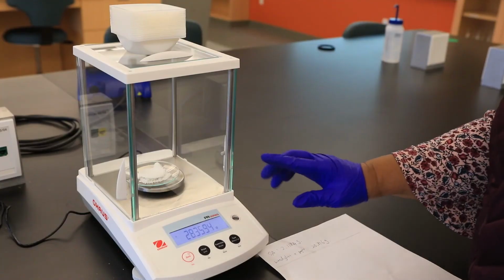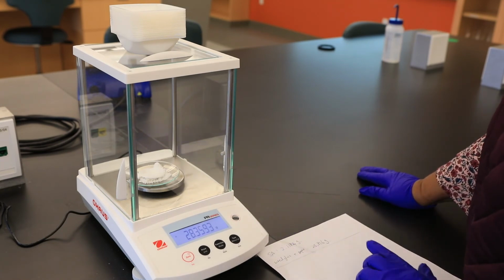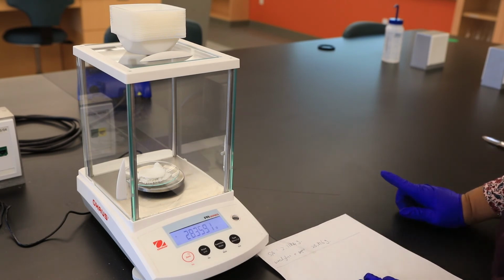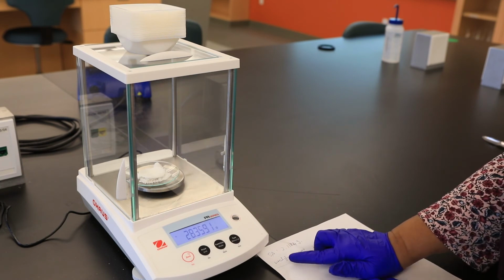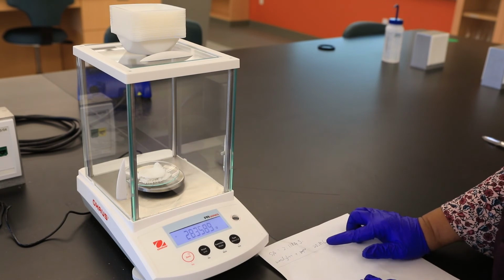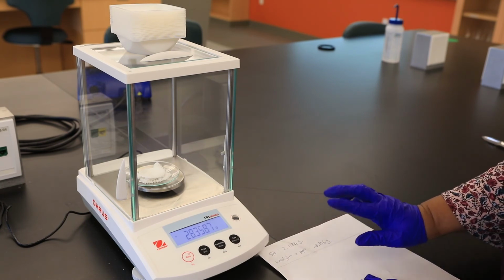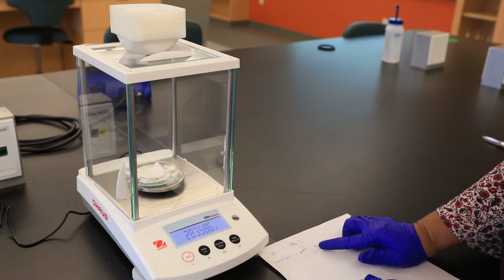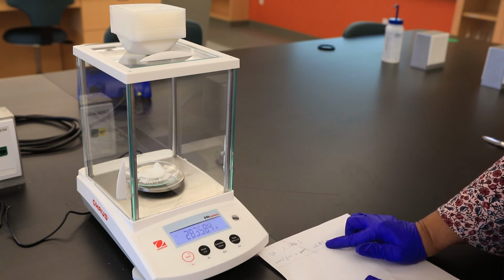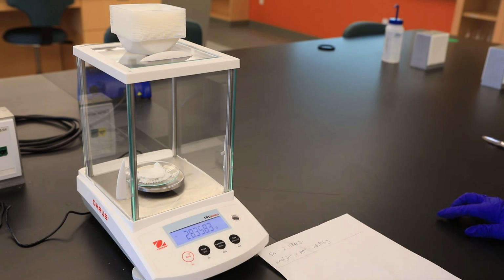So the mass now of the watch glass, aspirin and the filter paper is 28.359 grams. I should also point out to you that prior to this, I also pre-recorded the watch glass and the filter paper, and that mass was 25.816 grams. So the difference between those two, between 28.358 and 25.816 grams, will give you the mass of aspirin.